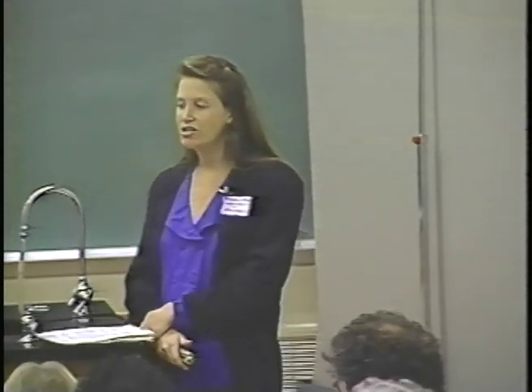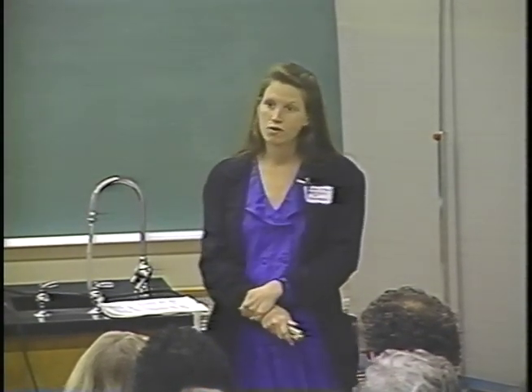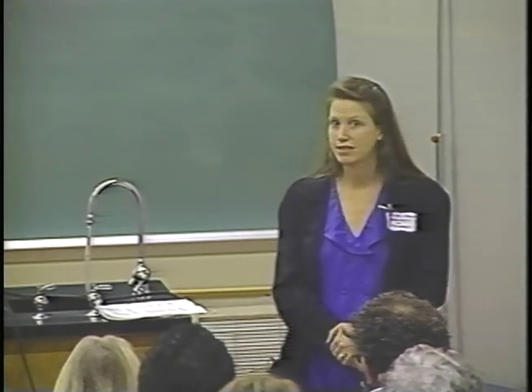I hope that you come away from this talk with a general knowledge of how to cryofix cells for freeze substitution or for cryoimaging, have a general sense of the advantage of these techniques over routine chemical fixation, and also look towards the promise of intermediate and high voltage electron microscopes for imaging thick frozen cells. If I could have the first slide, please.